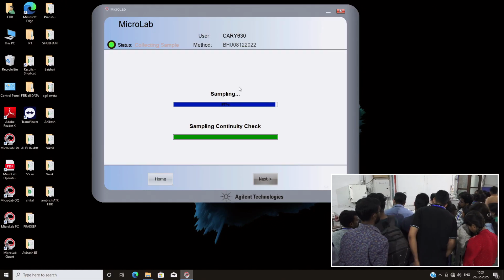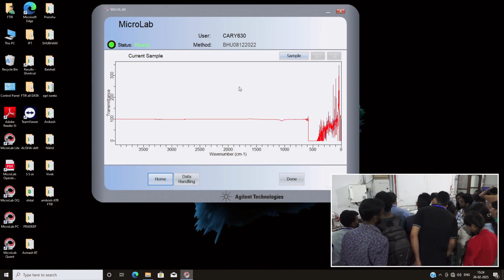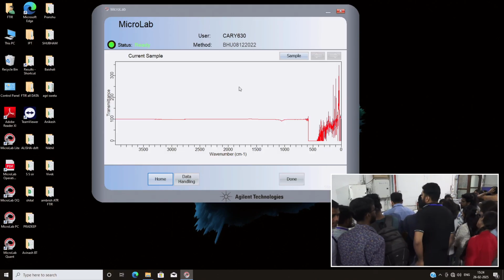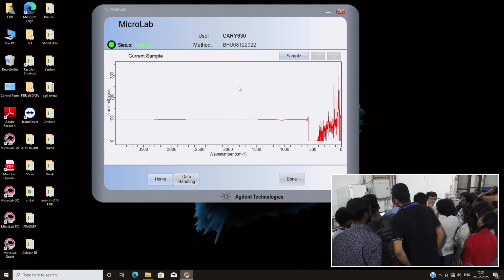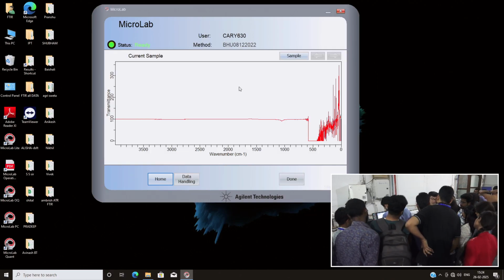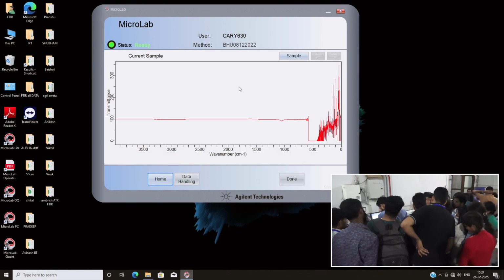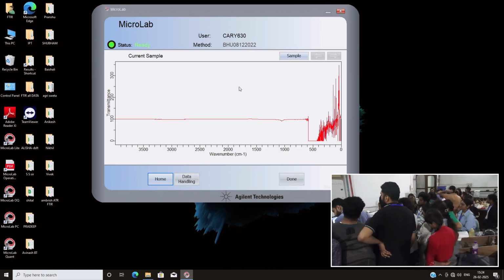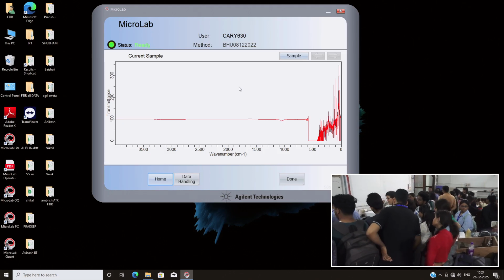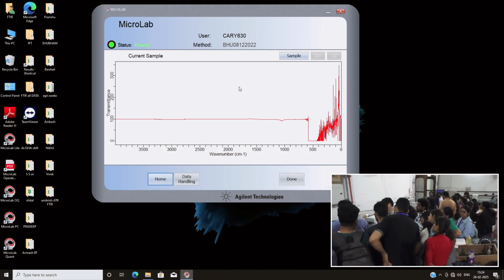So will that hamper our experiment? Will that cause any effect, since the width is not the same every time we measure it? It may affect. In particular, the distance from the prism affects the absorption intensity. So please repeat the experiment many times, at least 3 times, and this is a reproducible result.